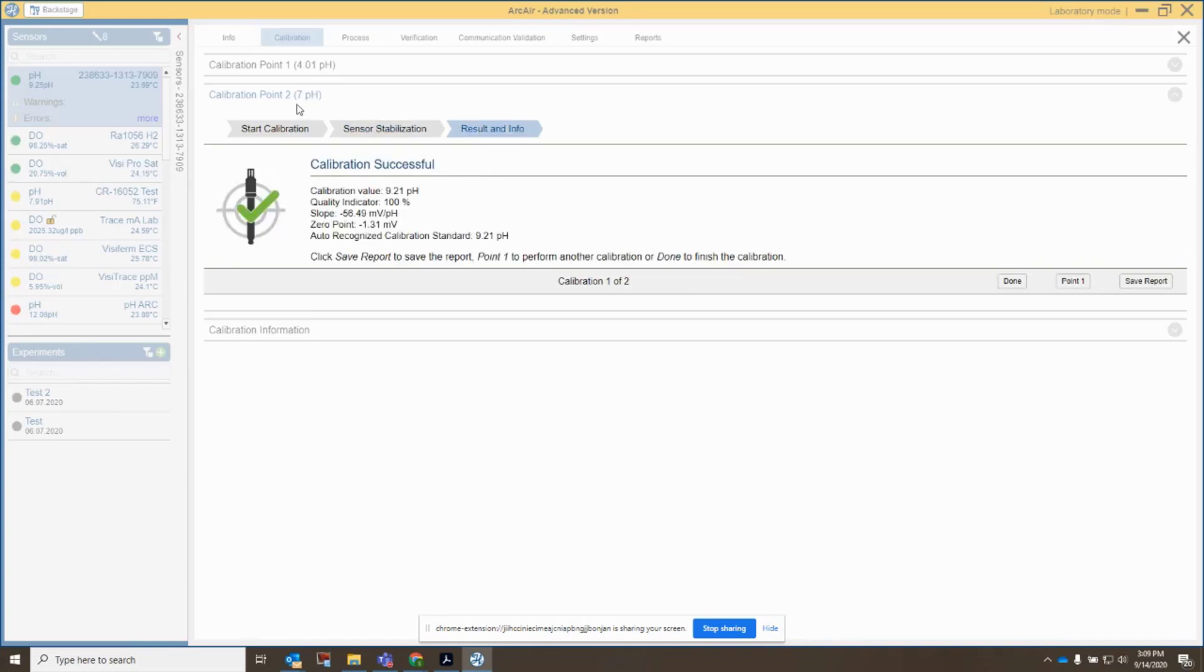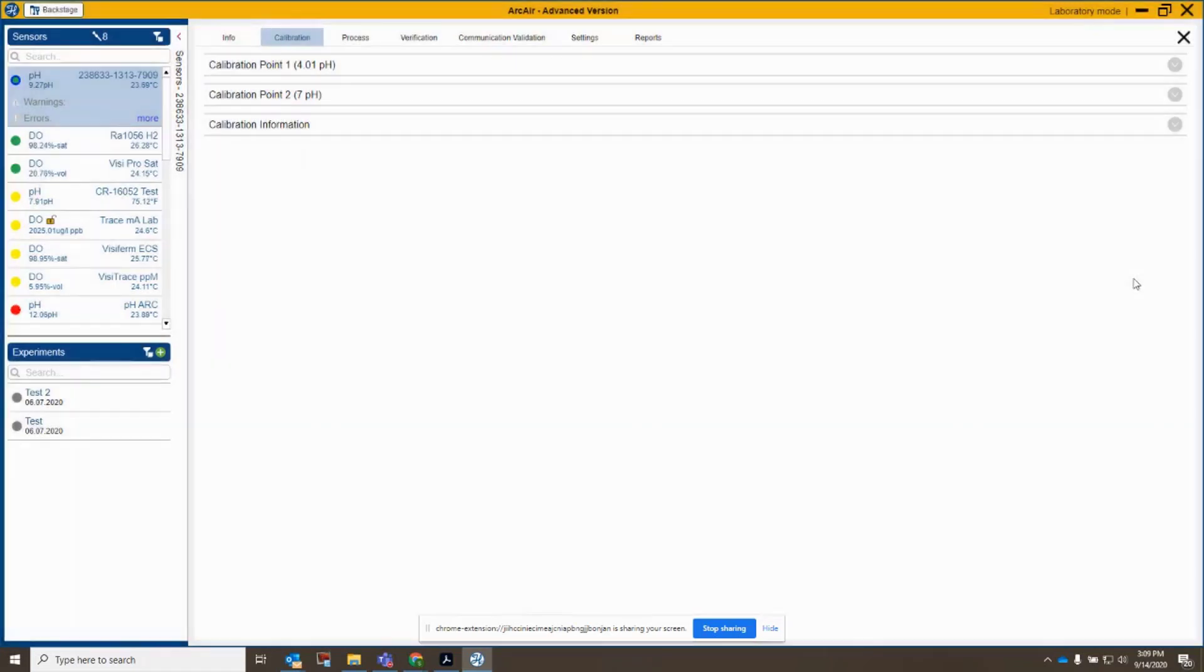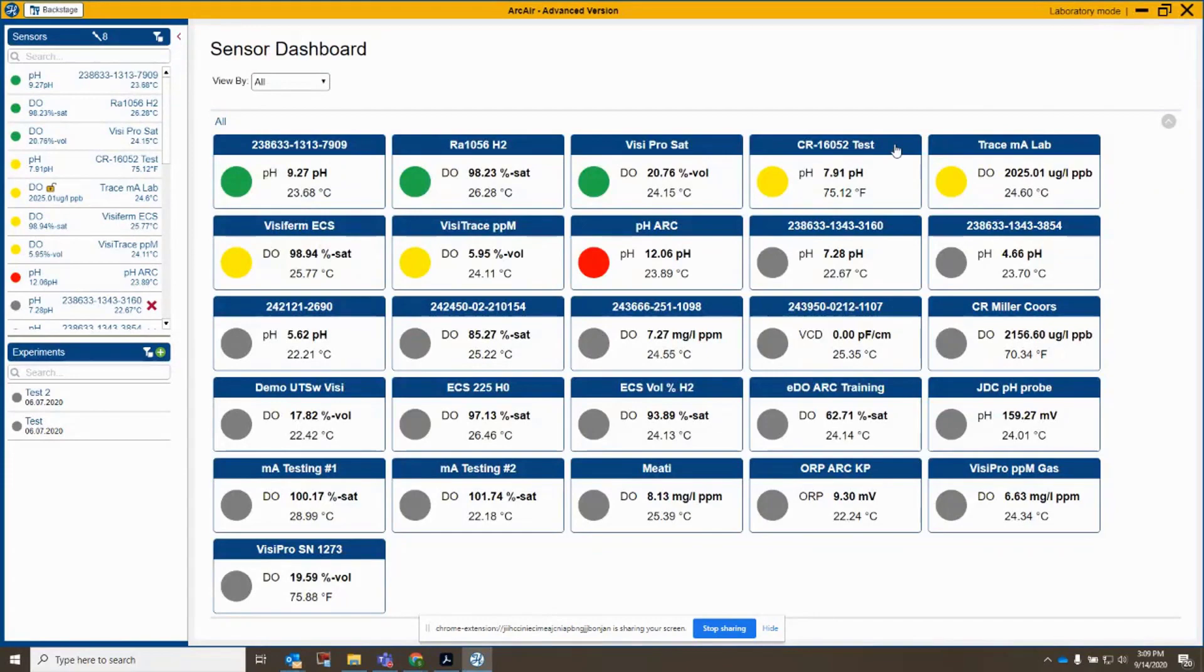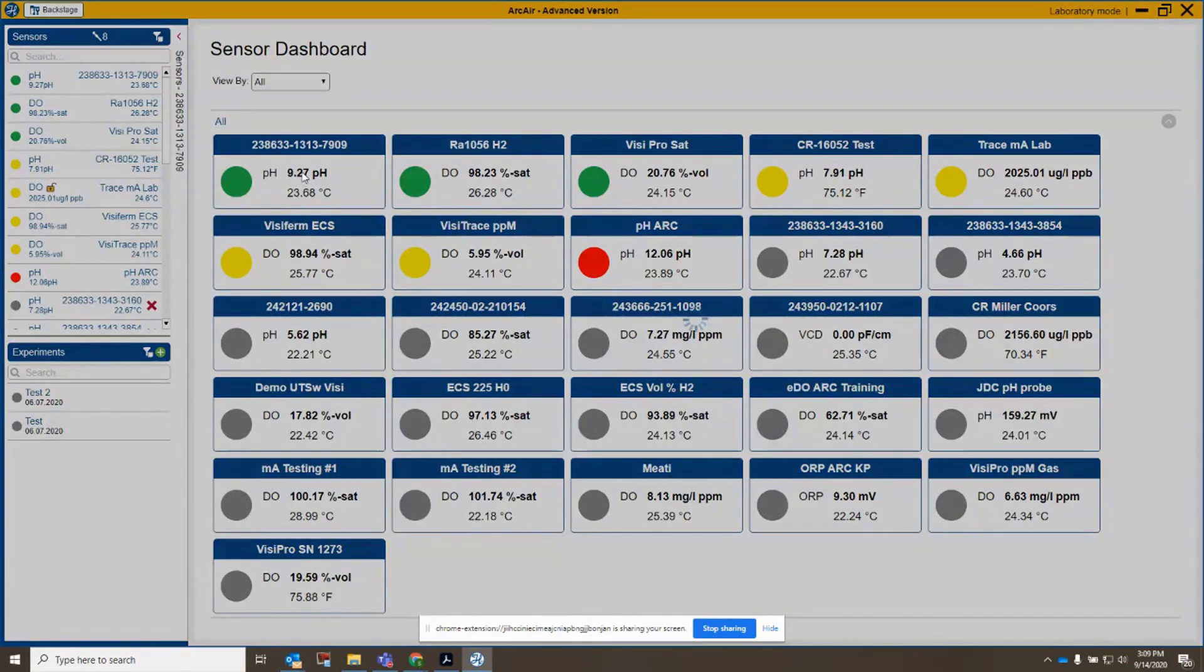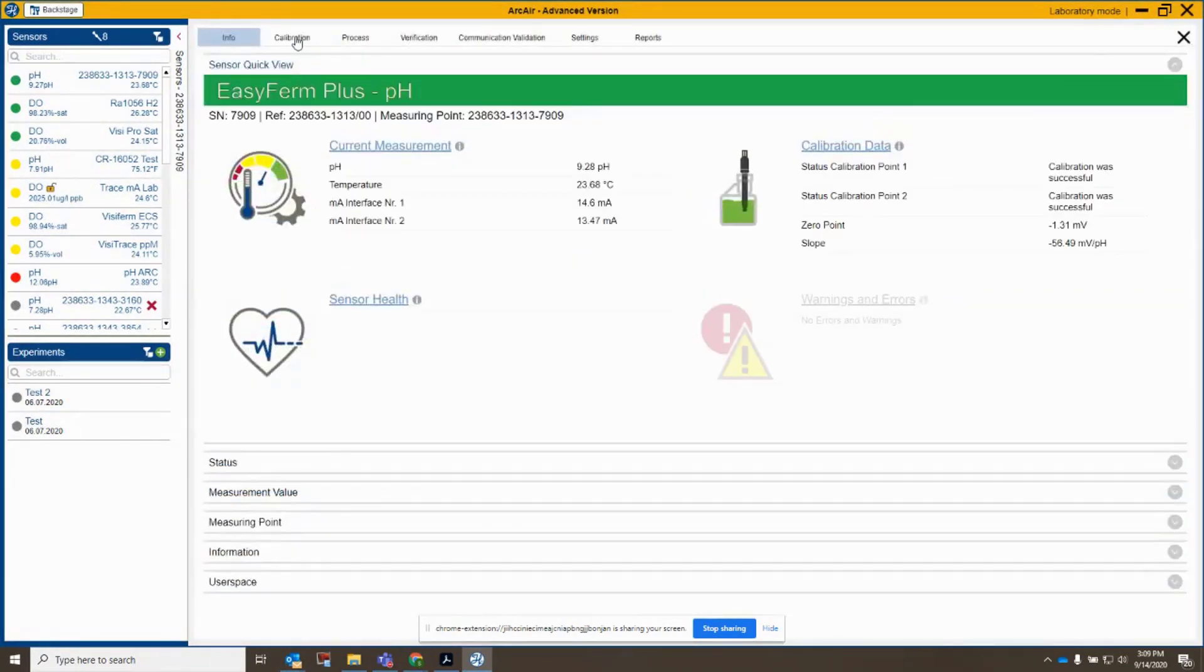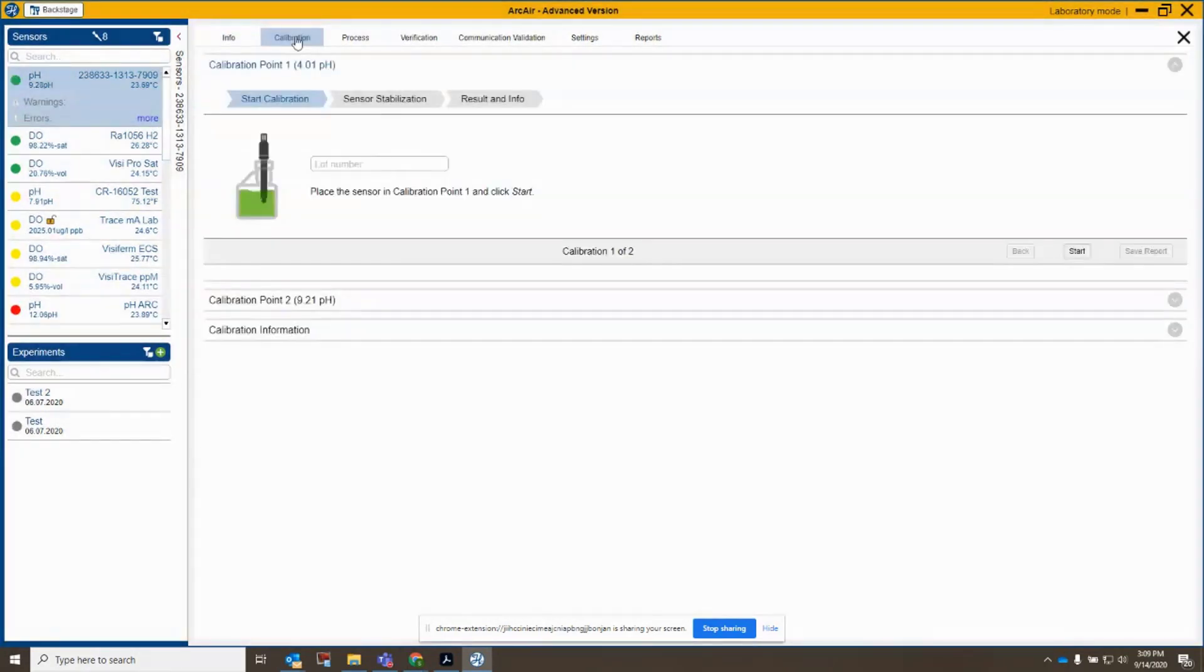And even though it says calibration point 2 at 7 pH, it actually passed at 9.21. It recognized that buffer, and it passed calibration. So if I click save here on my report, and if I go out and come back into my sensor here, it's green, which means everything is good. And I now see it's at 4.01 and 9.21 for my values.